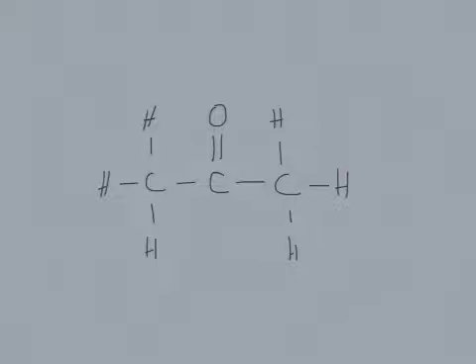So, for the left side, we don't use both sides of the atom because they are part of one group. So, we have our one hydrogen that we will add, and we will be looking at this hydrogen per se. Since they're all part of a group, we're going to look for adjacent hydrogens that would be bonded to whatever the carbon is. So, in this case, this other carbon.